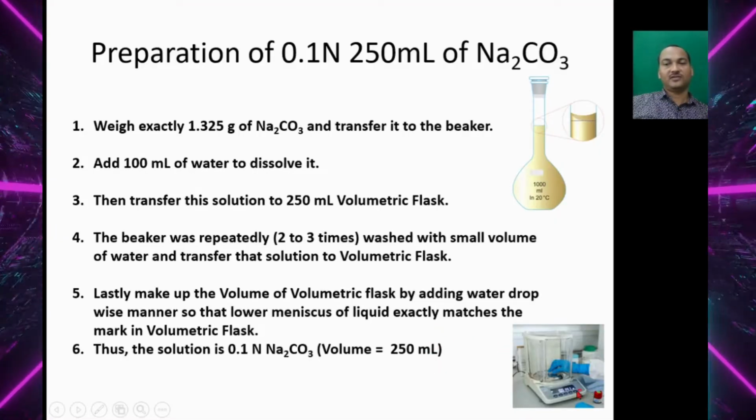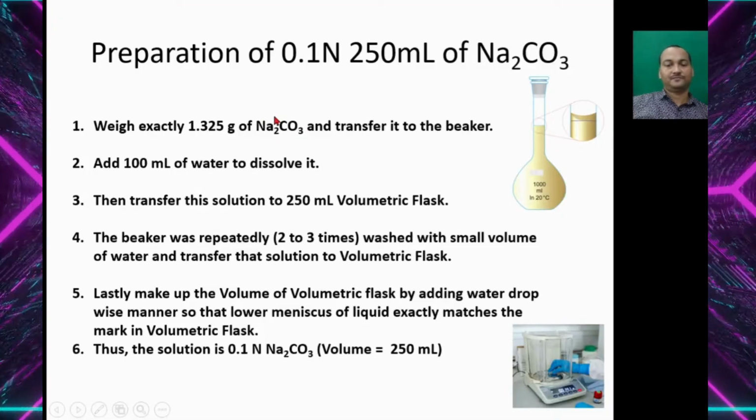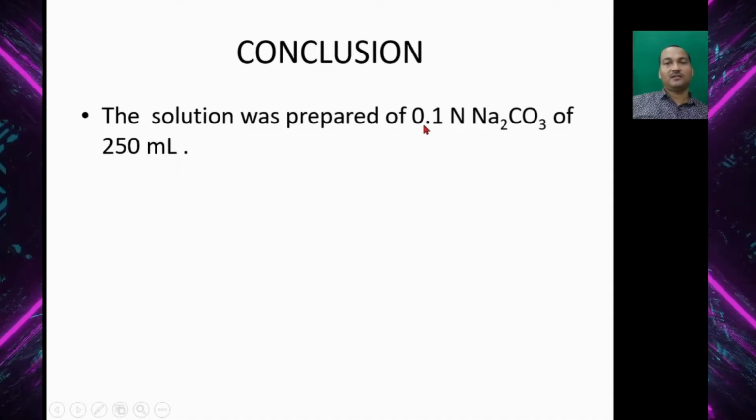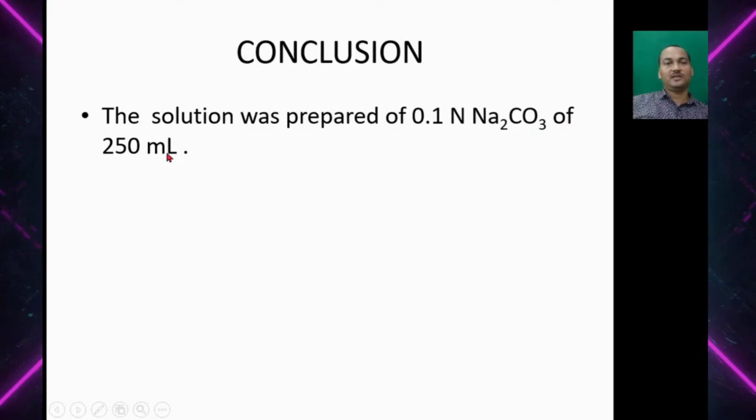And this is the weighing machine. So you have to take exactly 1.325 gram of sodium carbonate. So in conclusion, the solution prepared was 0.1 normal sodium carbonate and the volume is 250 ml.